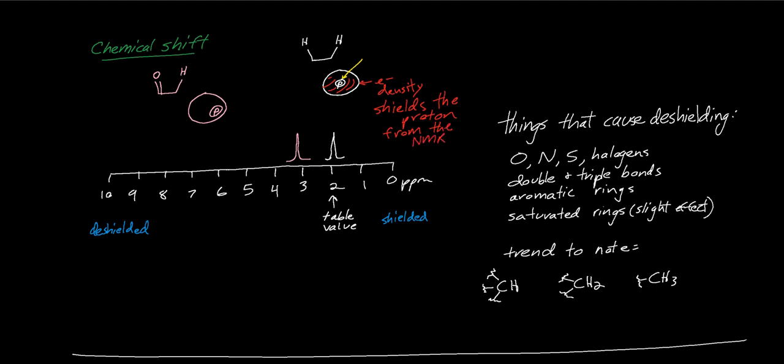So a normal, quote-unquote, proton that's normally shielded, for example, might be at 2 ppm, as shown here. There's your ppm units. That might be the value that you look up in a table for a certain type of hydrogen. The reason that the tables are not very useful, basically, is that you can have a phenomenon called de-shielding.